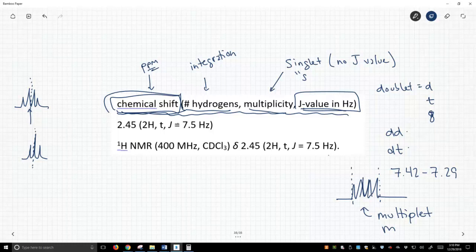Now for the full spectrum, you report all your peaks. So this is one signal right here. And you preface and say it's an NMR spectrum. What kind of NMR? Well, it's proton NMR. You report the field strength of your magnet. And you ought to report what solvent you used to acquire the spectrum, what you dissolved the sample in.